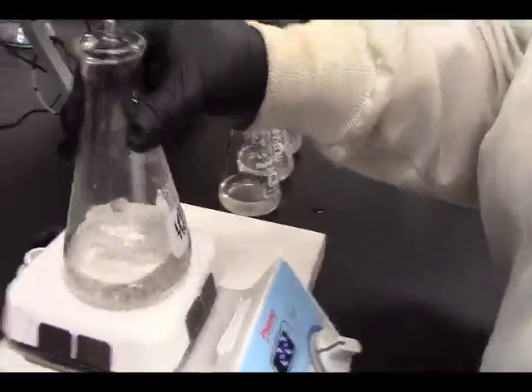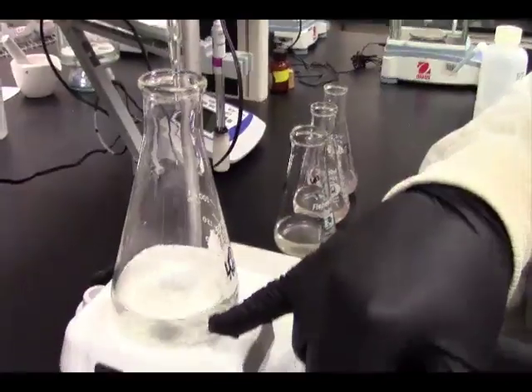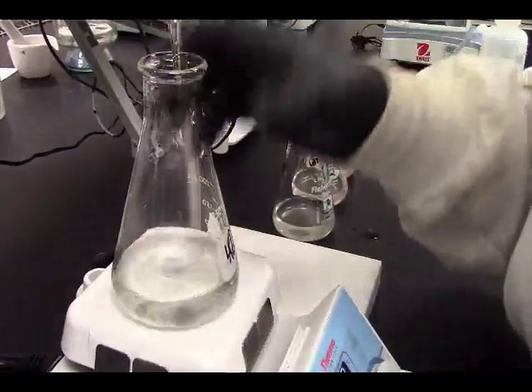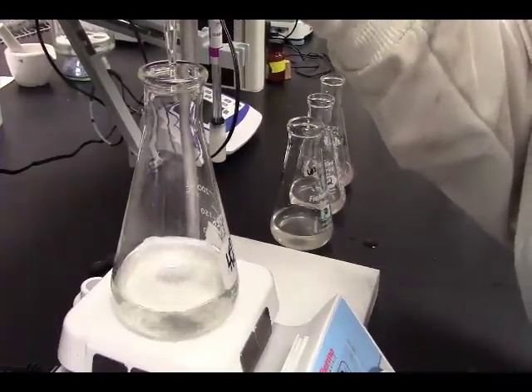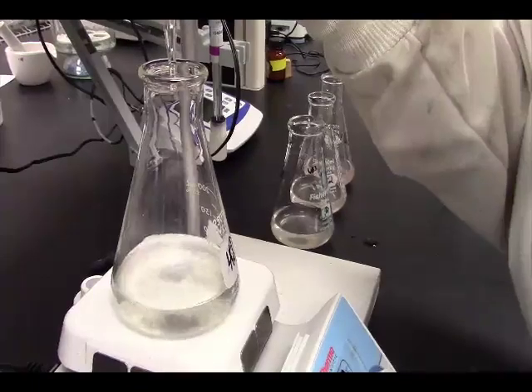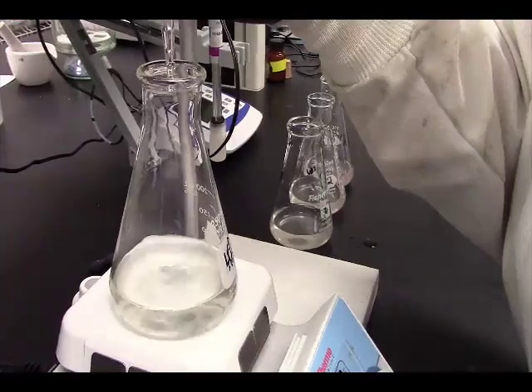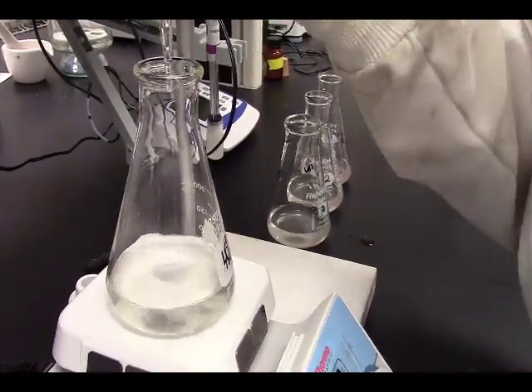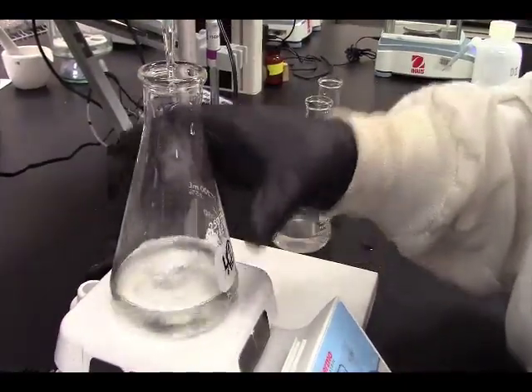Just as a reminder, we're using phenolphthalein as our indicator. Phenolphthalein is clear in acid, so this contains our ascorbic acid that we're actually titrating. The titrant is the base, and as this gets to a neutral pH, you need to actually look up the pH that phenolphthalein changes from clear to pink so that you can discuss that and why we're able to use this indicator in neutralization reactions.